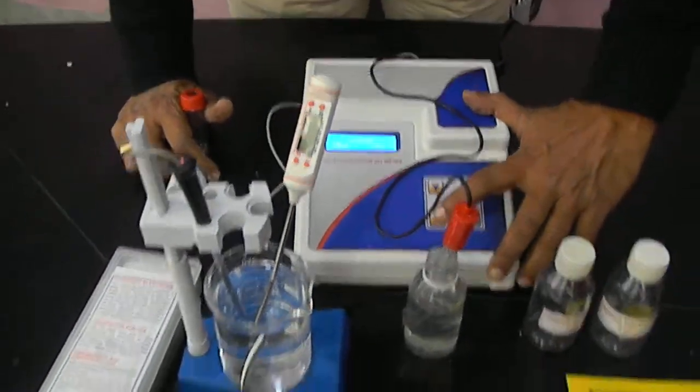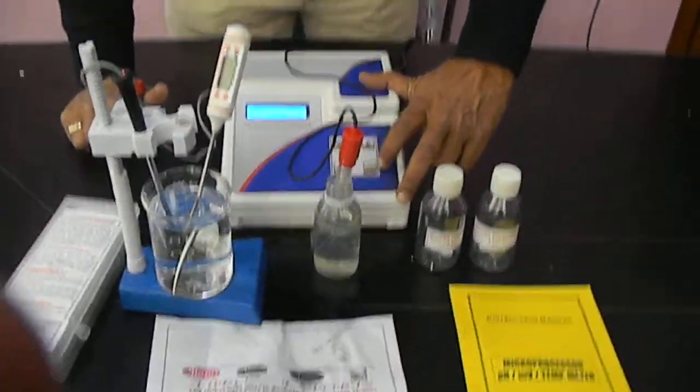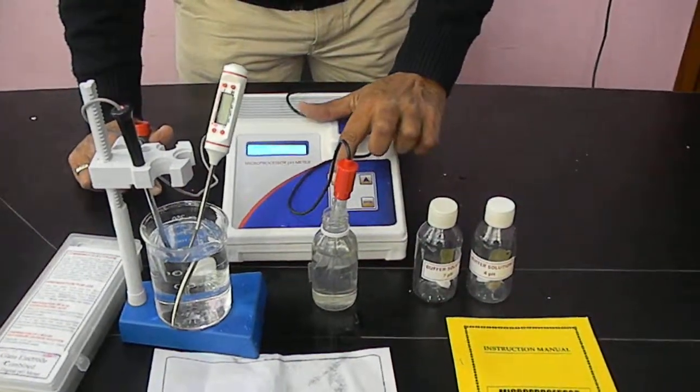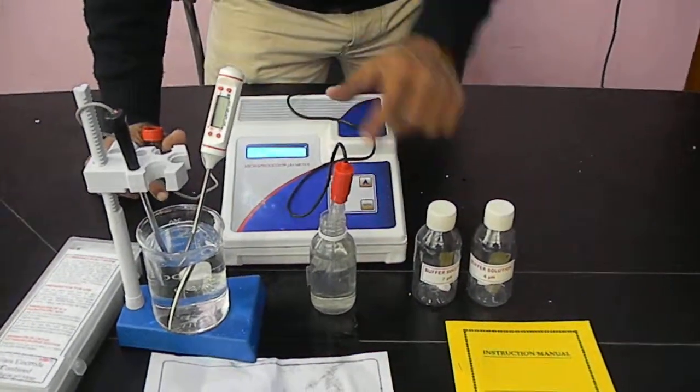Now another selection is mode selection. We go with the reading — read, enter, and select. Then we go with the mode: pH mode. Selected by pH mode. Enter this, and there is a reading now.